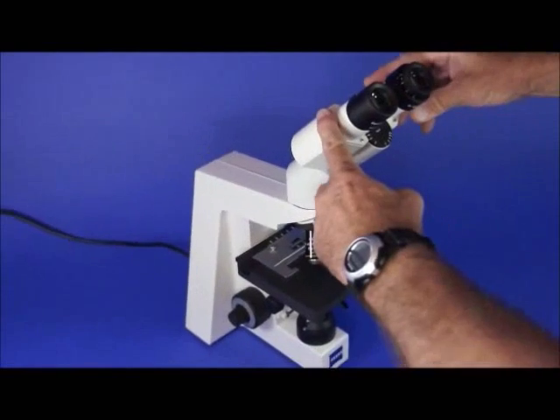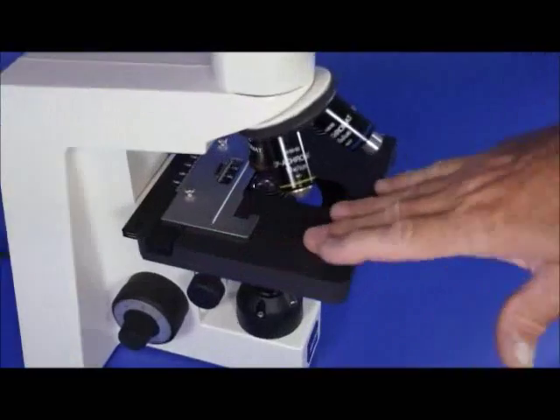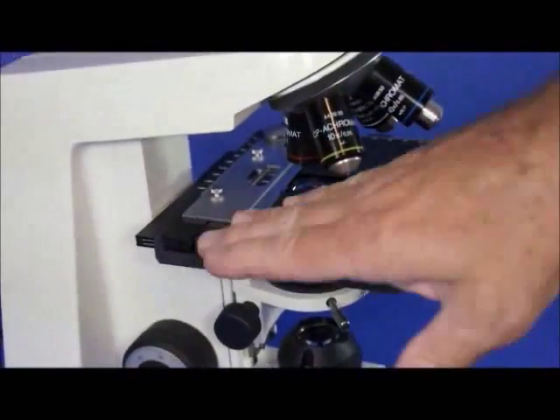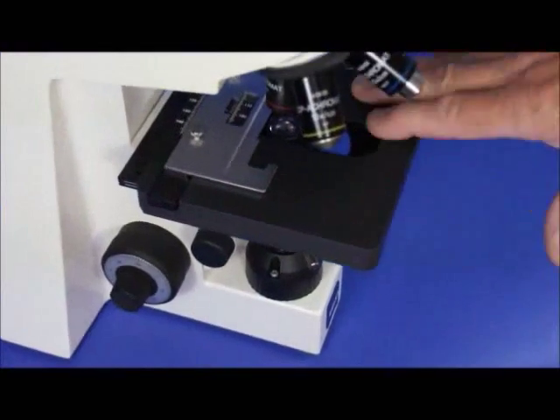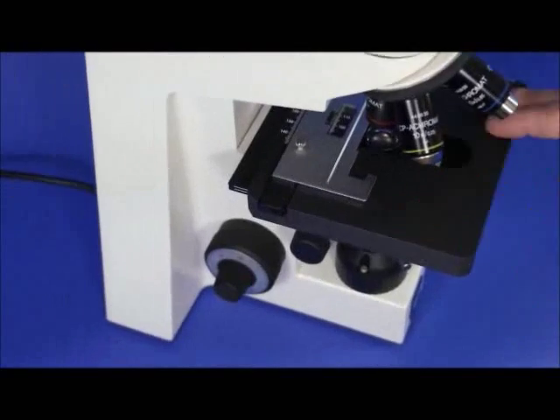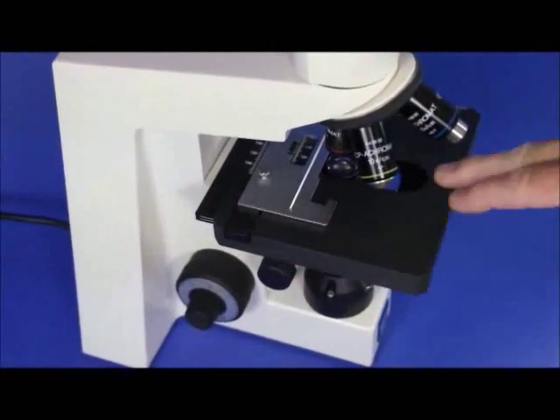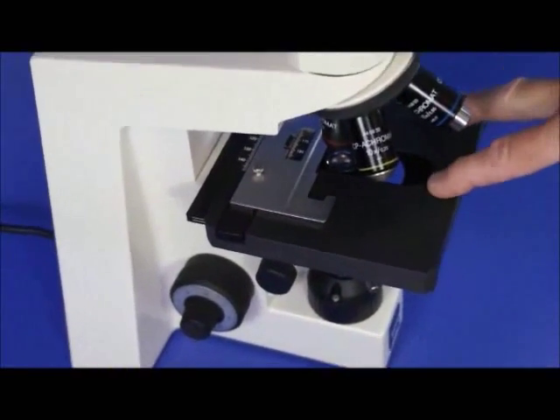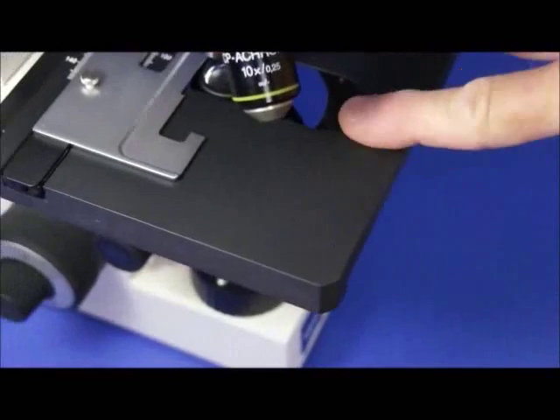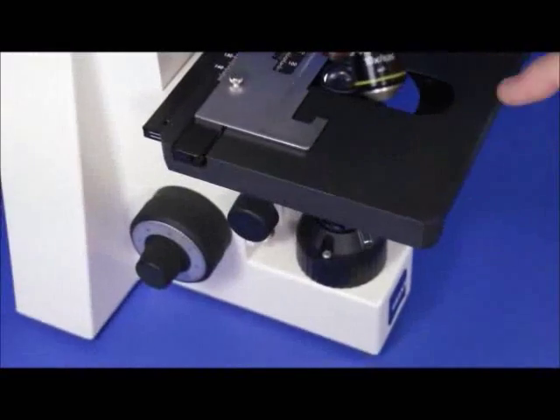Another nice thing about this scope is the stage — it's a ceramic stage, not a regular metal stage like most stages are. They cost a lot more because they never wear out. They don't scratch — you don't see gouge marks, tears, or paint rubbing off. It's ceramic and built to last. This stage is basically mar-free, scratch-free, oil-free, and chemical resistant.